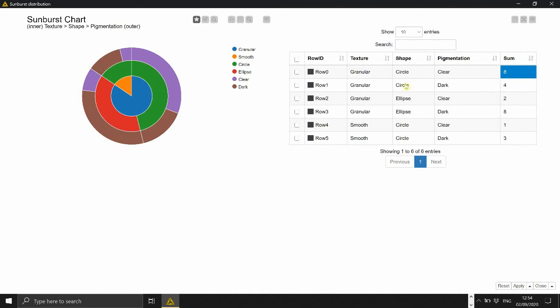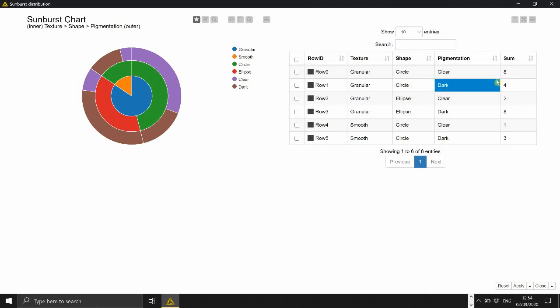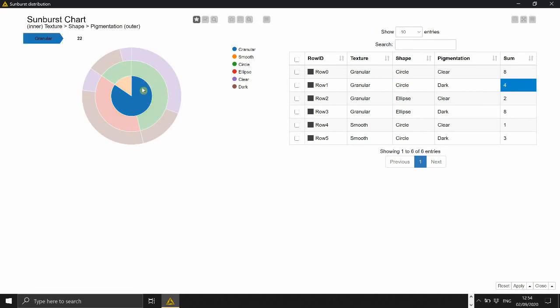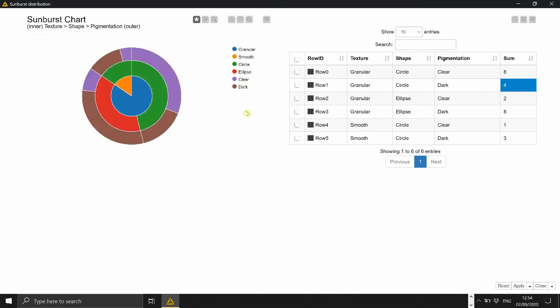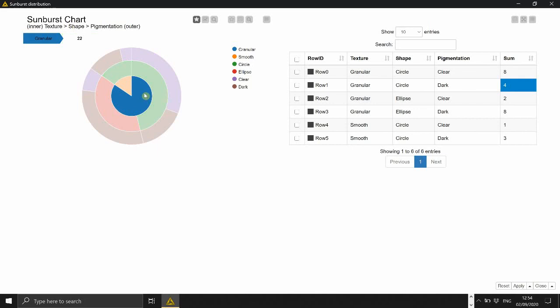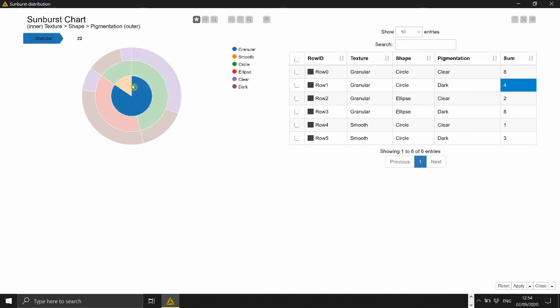So you see we basically we have counted how many embryos are granular and circular and with a clear pigmentation. So there are eight of those guys. For another combination of phenotypes so granular circle but this time a dark pigmentation we have only four. And this is what is represented here as well.